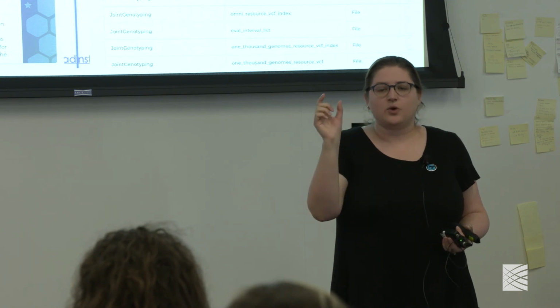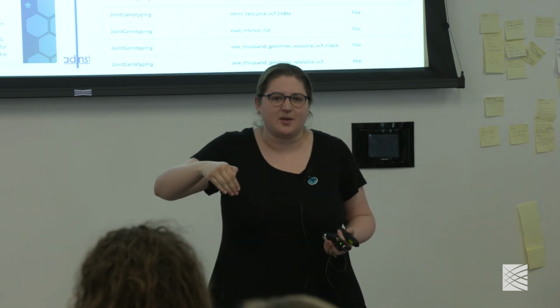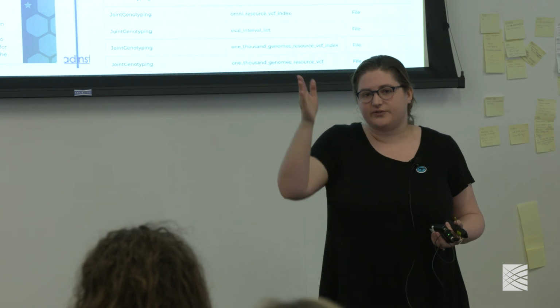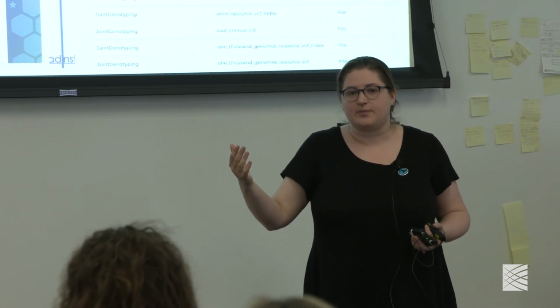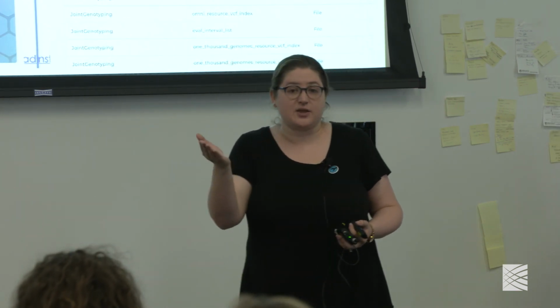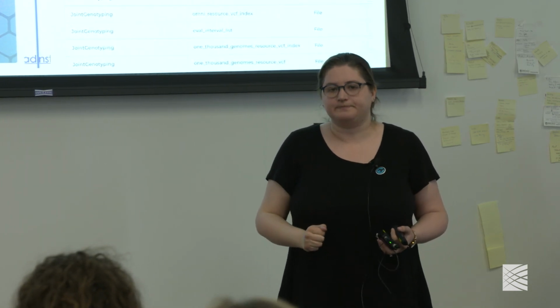So the question was how to understand the filters that are coming out of the Mutect2 pipeline. And it should have filters that will say germline event. So if you look at the filters for each of the sites, you should know why it was filtered out. Some sites will be filtered out because there wasn't enough evidence. Some sites will be filtered out because it's likely a sequencing artifact. And it will tell you that in the filter. Or if it's a germline event from your matched normal, it will tell you that there too.